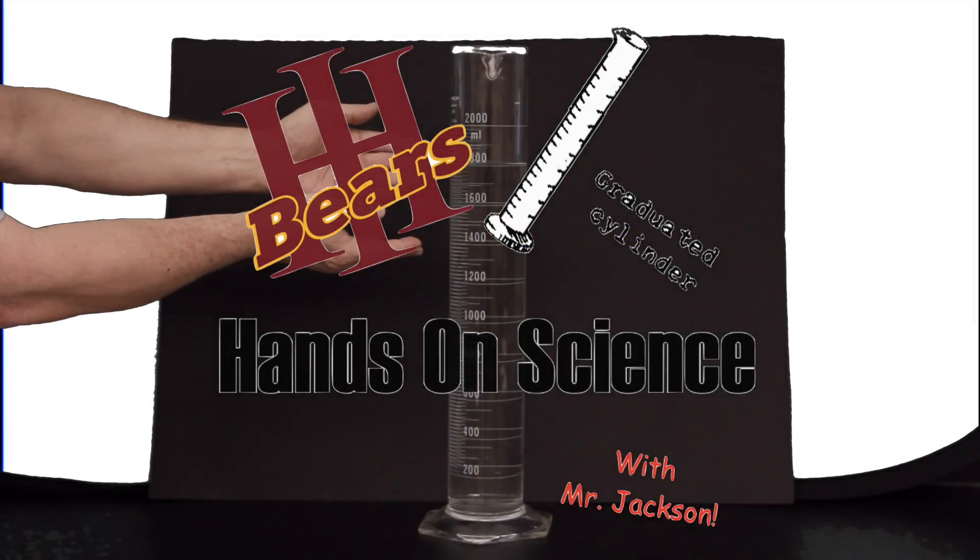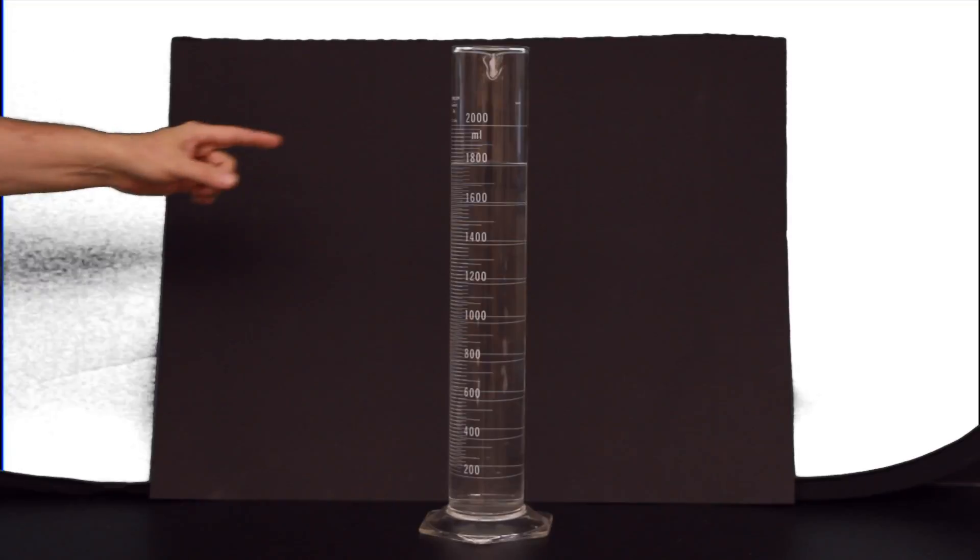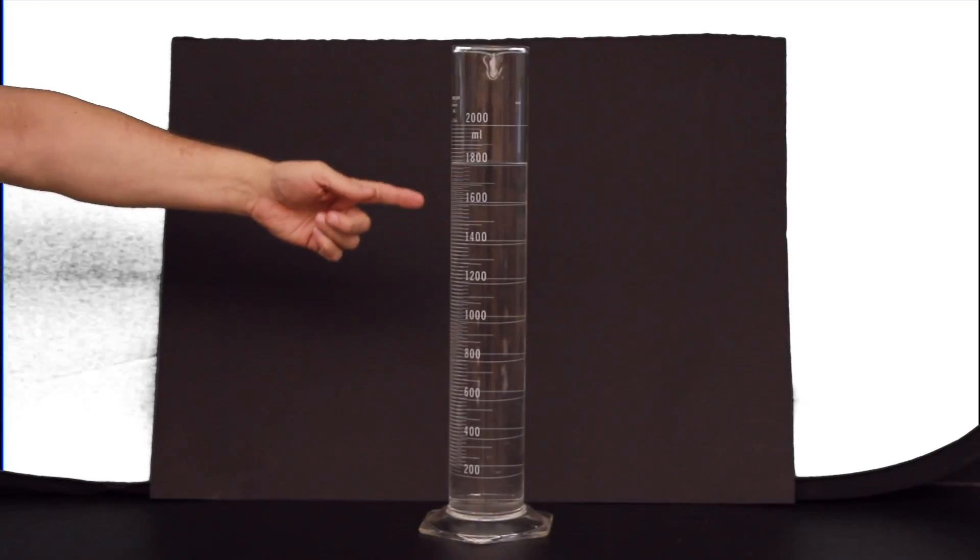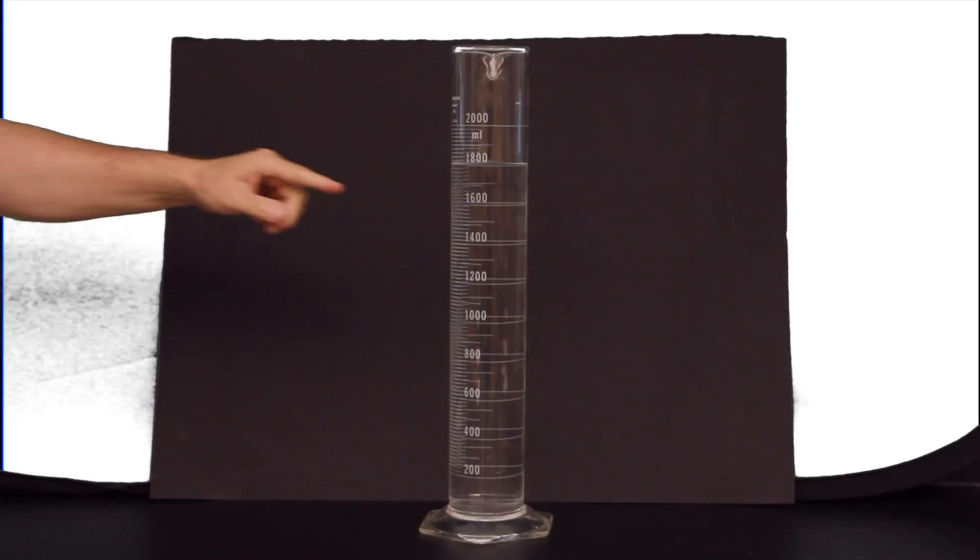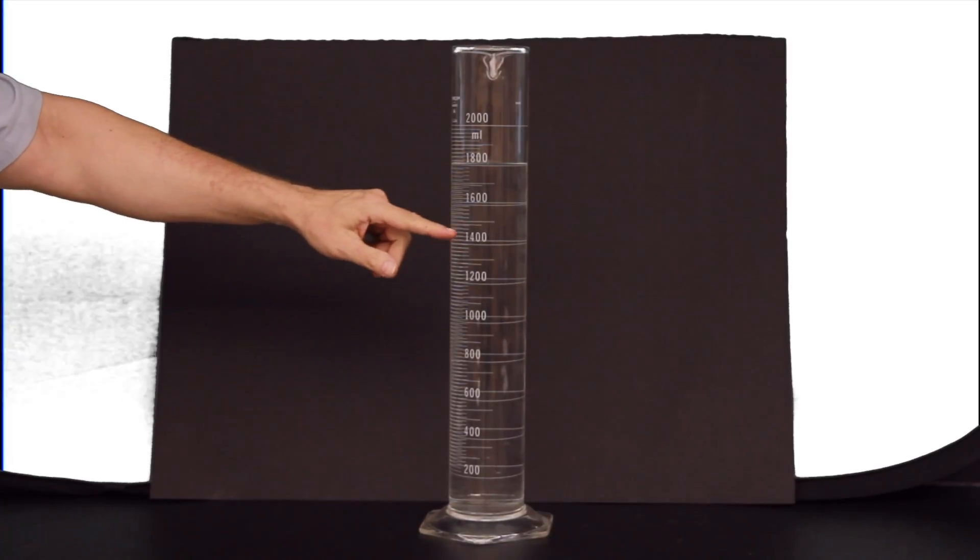Hands-on the graduated cylinder. The graduated cylinder is one of the most common pieces of lab equipment used to measure liquid volume. It gets its name from the measuring lines, called graduations, found along the side of it.